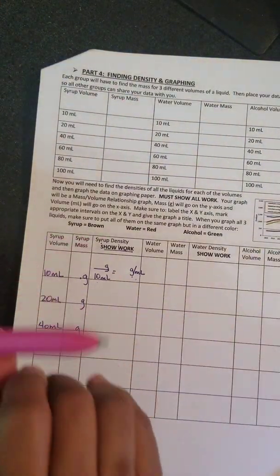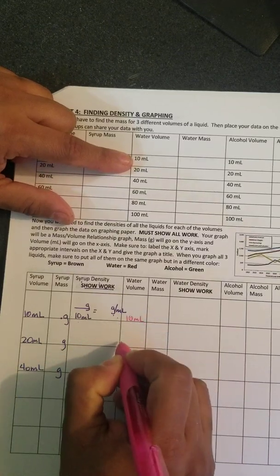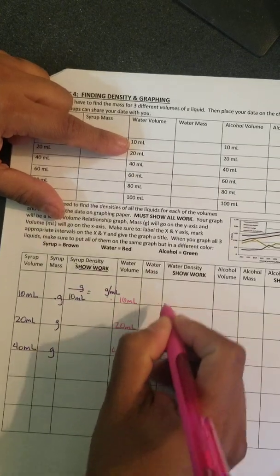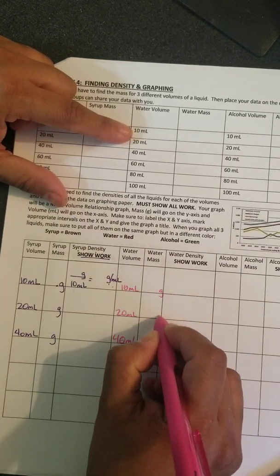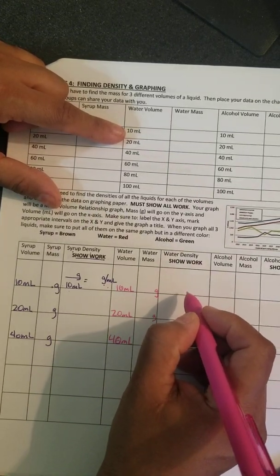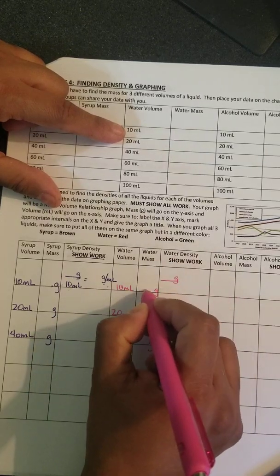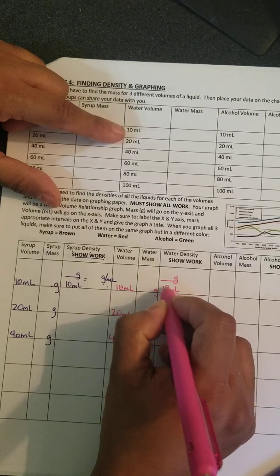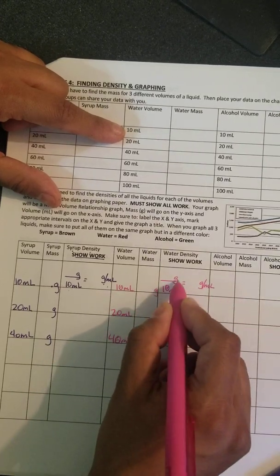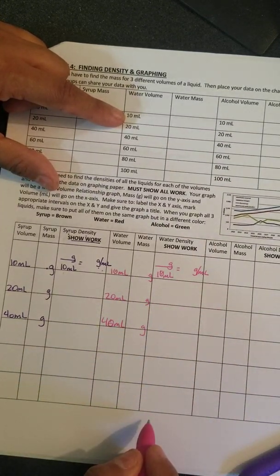You're going to do it again over here for water. We're going to get the volume of the water, which we're starting off with 10 mLs, 20 mLs, 40 mLs, and then you're going to go ahead and get the mass here in grams, grams, grams. You're going to find the density by doing the math. Density is mass over volume, or we don't know the mass yet, over 10 mLs equals your answer in grams per milliliters, right? Those units do not cancel out. And you're going to keep on doing it all the way down.